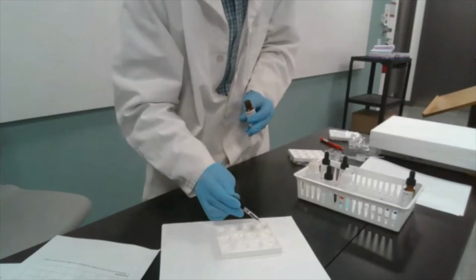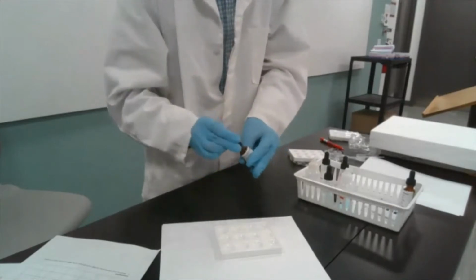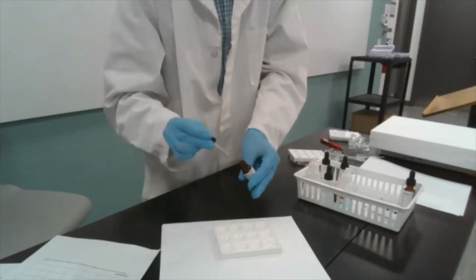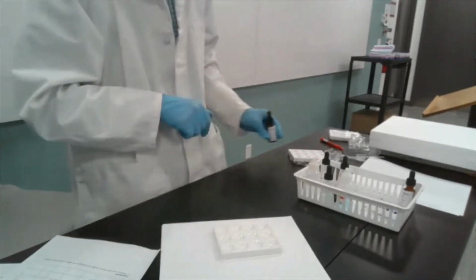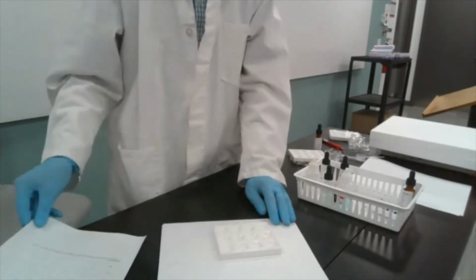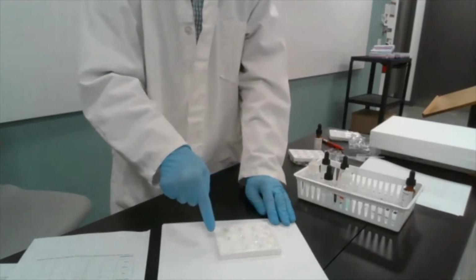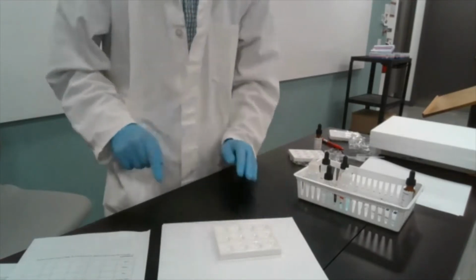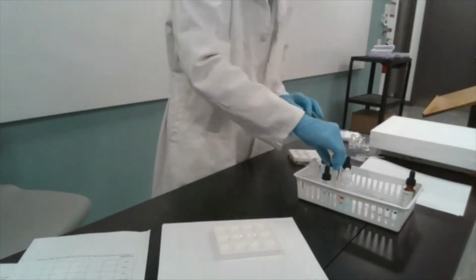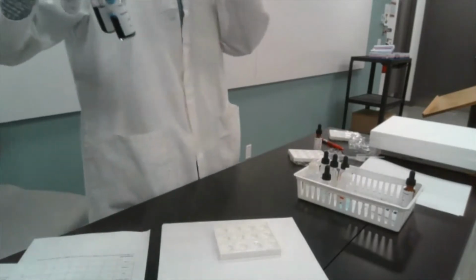I'm going to add it to the last row on this 3x4 plate. So right now we have the same arrangement as you have in your table: distilled water first, sodium hydroxide next, HCl. And I'm going to start adding the indicators. I'm going to show you very briefly what they are.